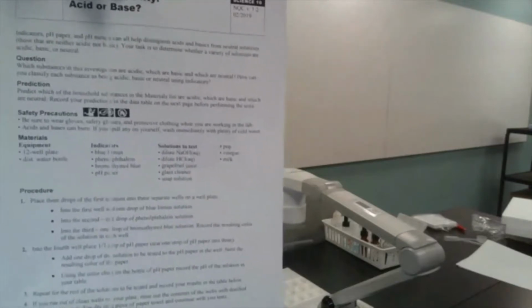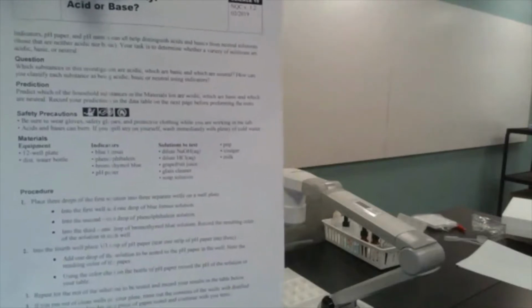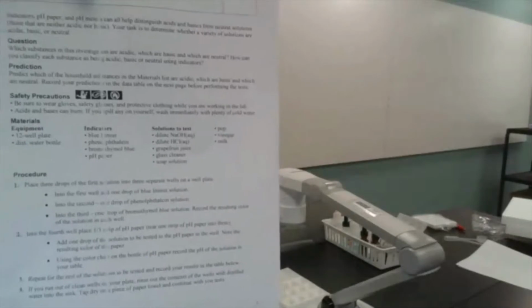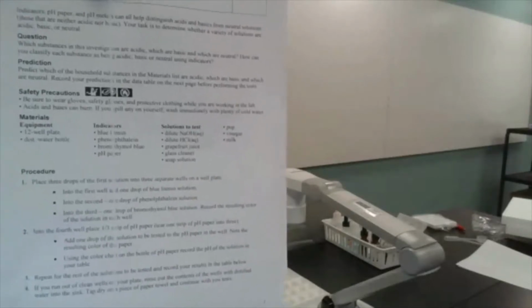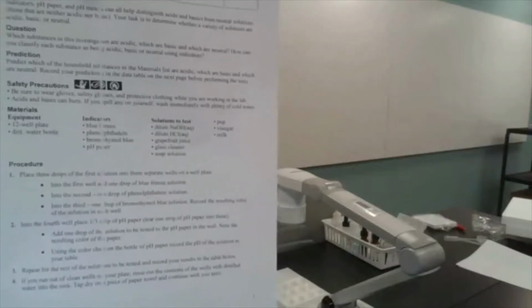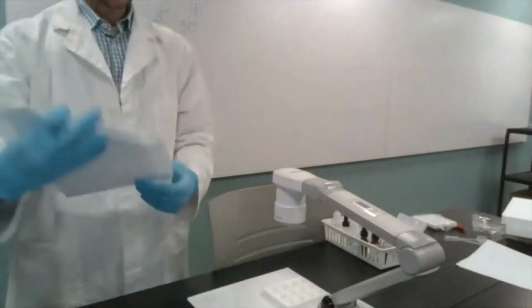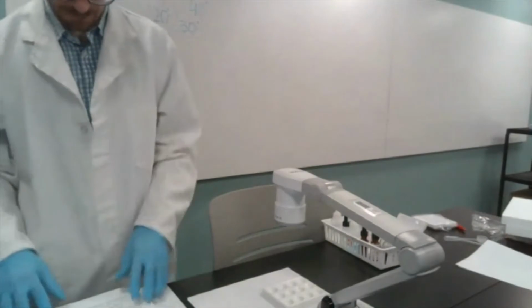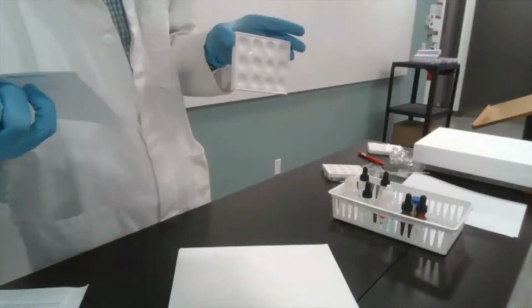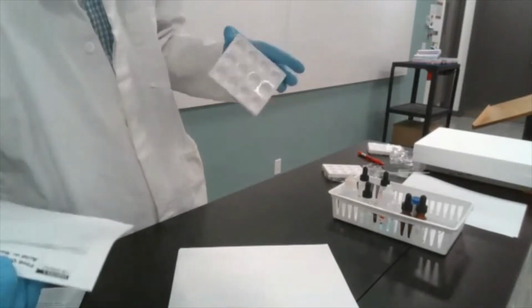And then we're going to use that knowledge and observation to determine, using those same indicators, whether grapefruit juice and everything that's listed under it or below it is an acid or a base. So that's the big plan for today. Substances: the first one is distilled water, then sodium hydroxide, and then HCl.